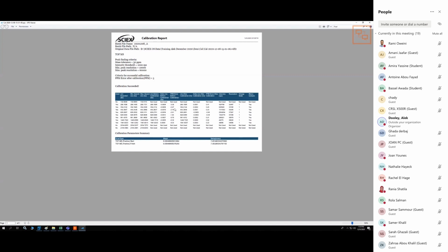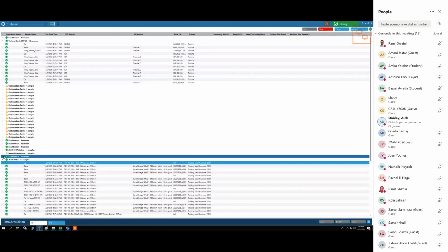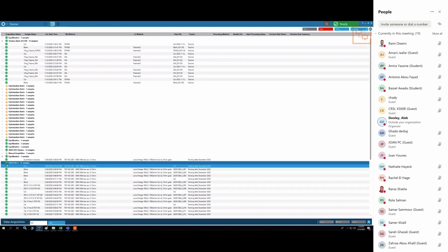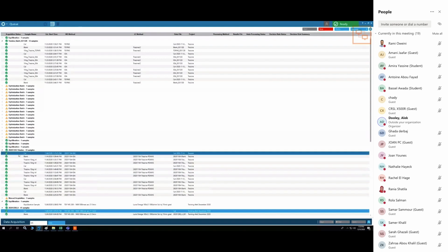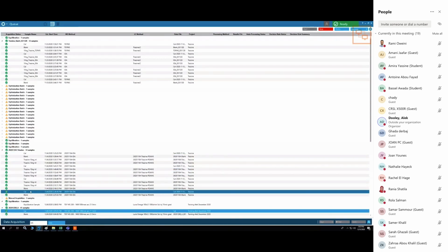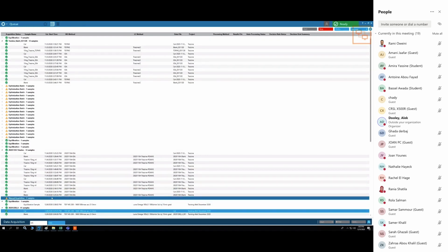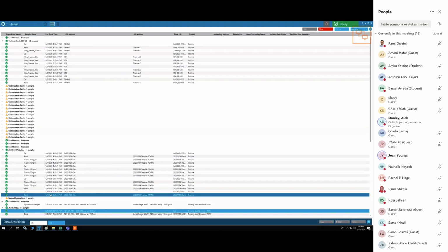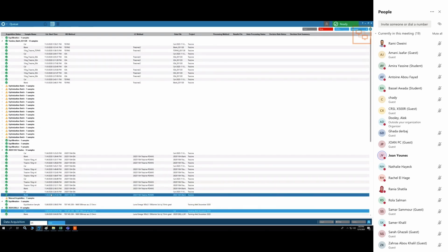So if you remember yesterday, well, we can look. Let's have a look. I don't know what's the answer. I was going to ask myself a question, but I don't even know the answer. So when was the last time it was calibrated? Probably here, right? So this was run on. You can use the other calibration, the one that's beyond that to monitor.